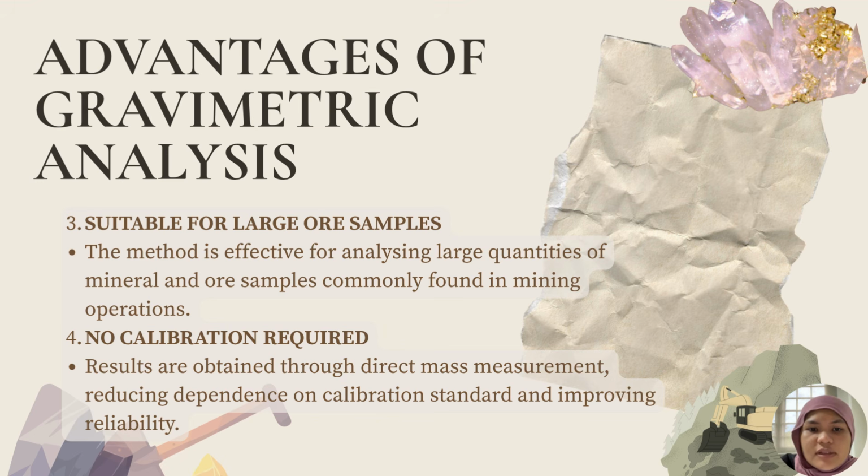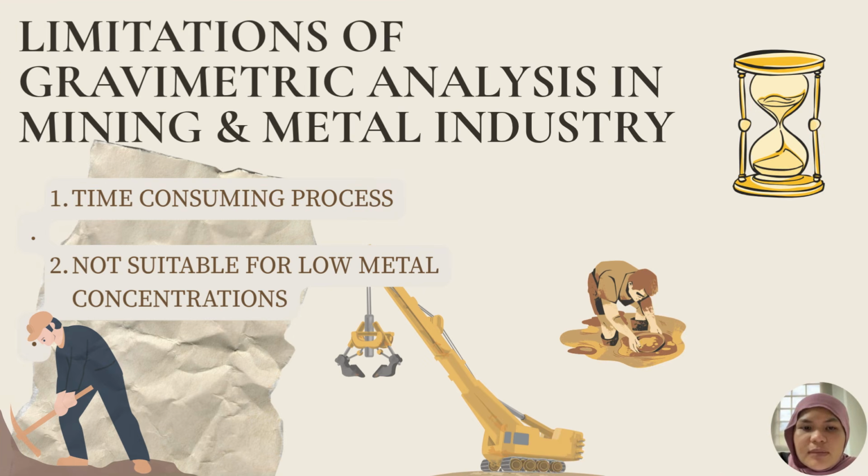Fourth, no calibration required. Results are obtained through direct mass measurement, reducing dependence on calibration standards and improving reliability. For the limitations of gravimetric analysis in the mining and metal industry, first, it is a time-consuming process.